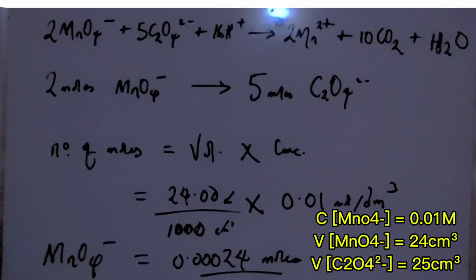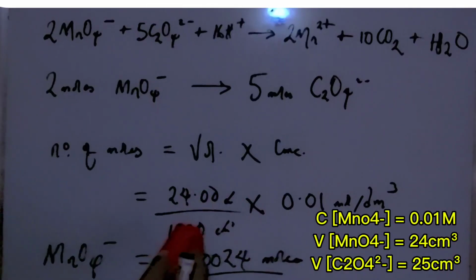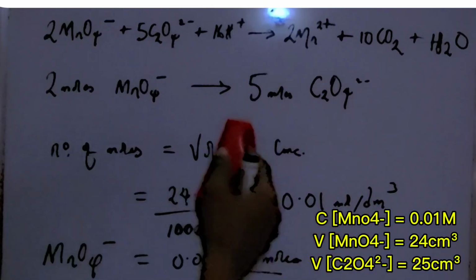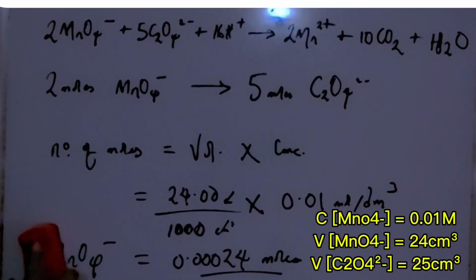So how would you now calculate the number of moles for the oxalate? If you want to calculate the moles of the oxalate, that is essentially equivalent to the moles of the calcium carbonate, because this oxalate was precipitated from the calcium carbonate, going from equation 1 through equation 2, as I said earlier. So I'm going to wipe this off.